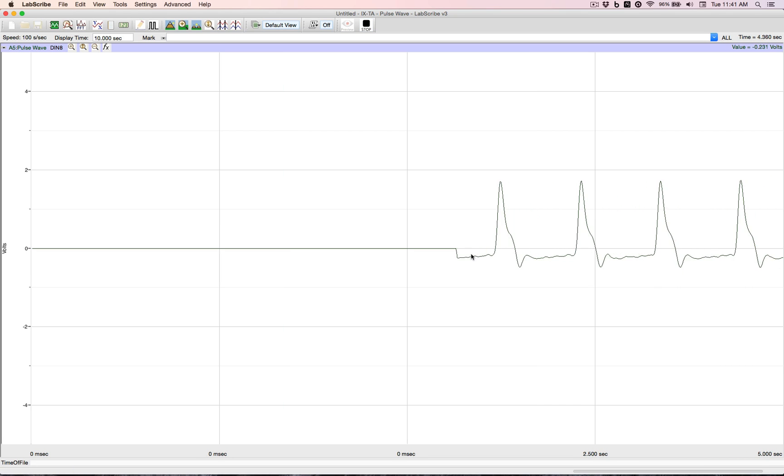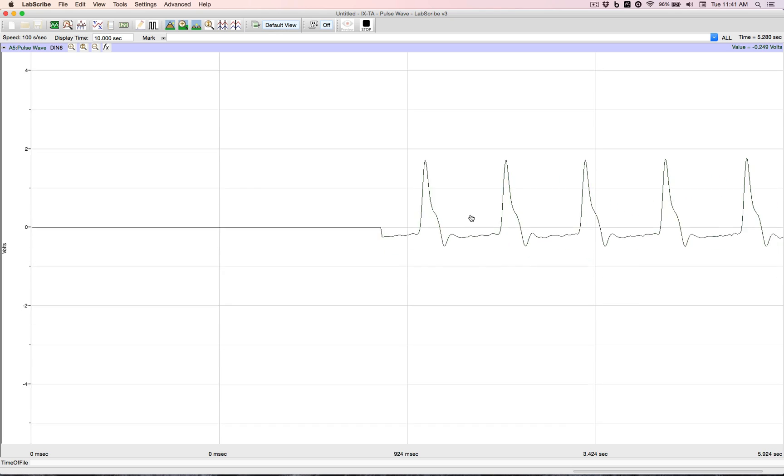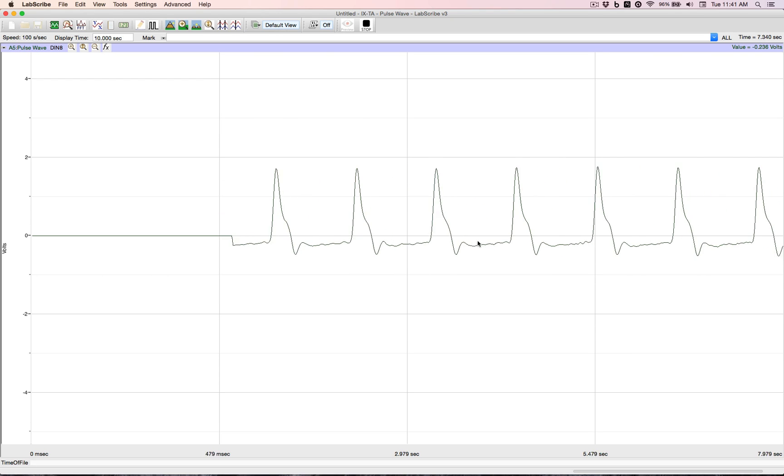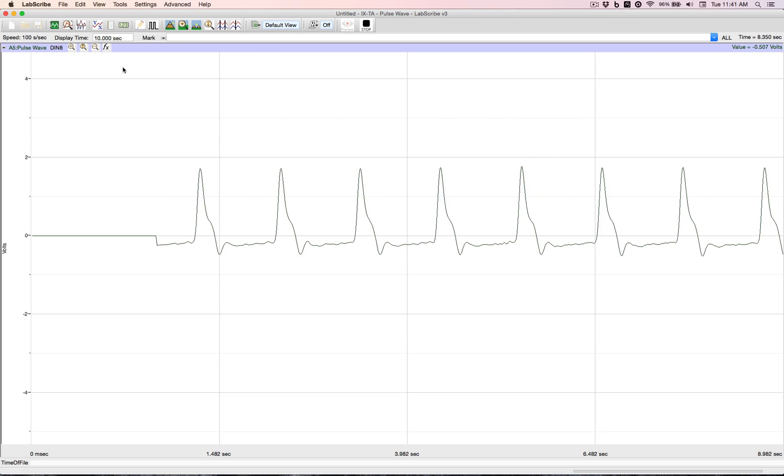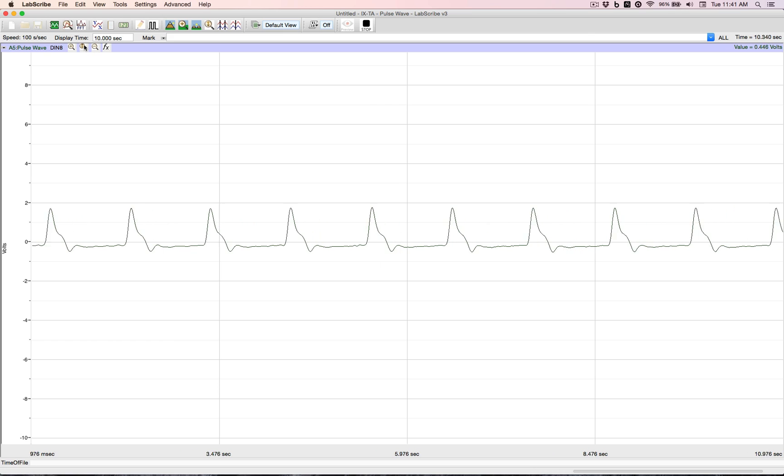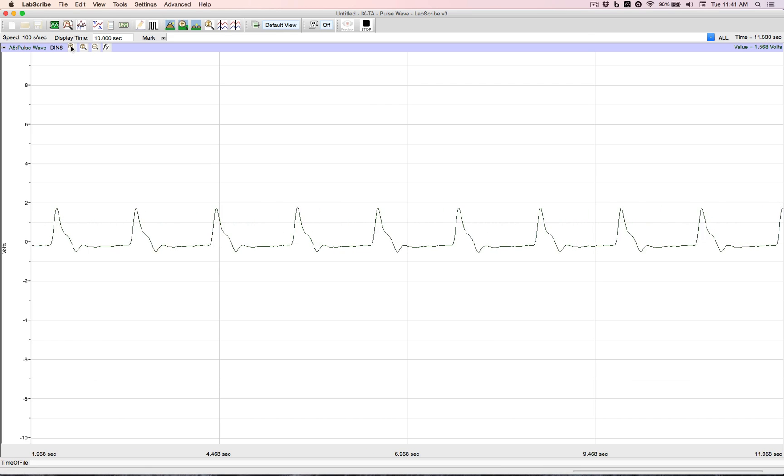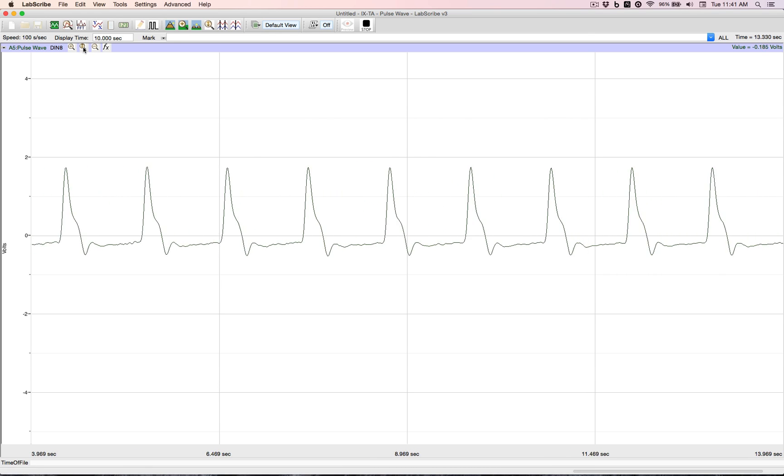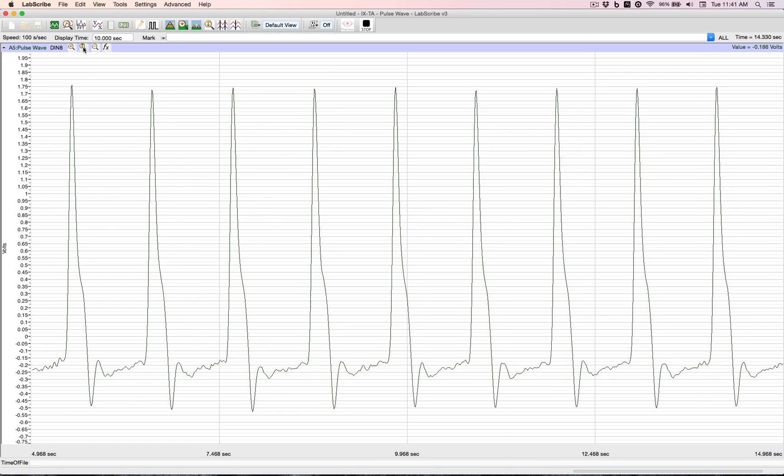Now, I can move the trace up and down. I can decrease the display of it. I can increase the display of it. Or I can just hit autoscale and fill it out full range.